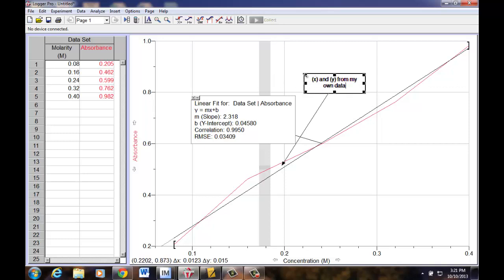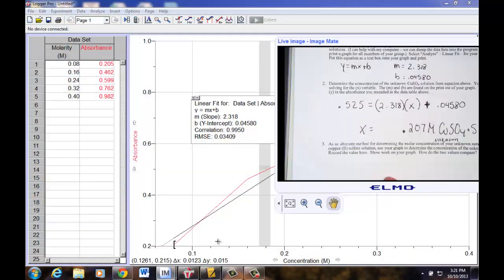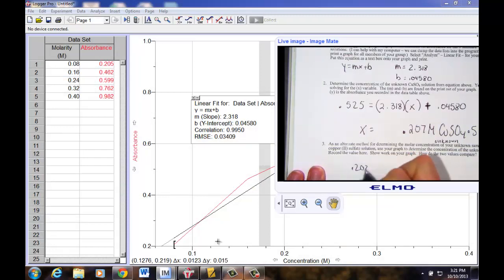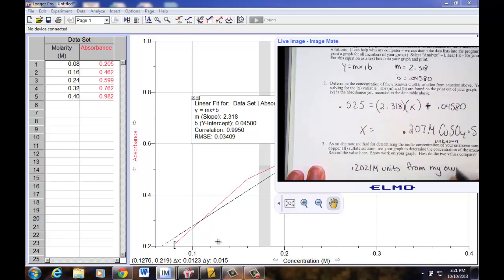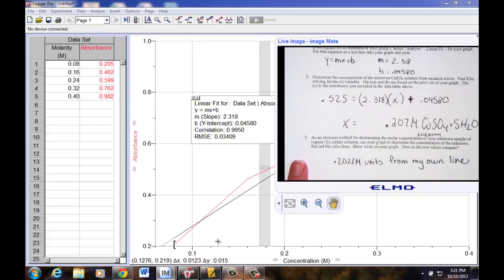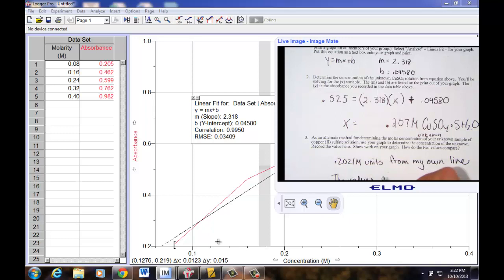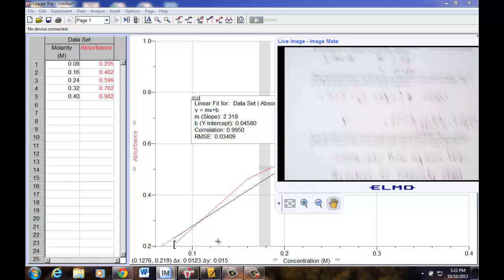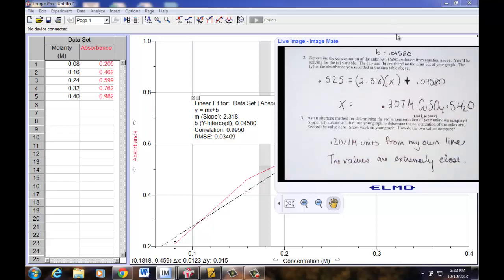This is my X and Y coordinate from my own graph. So now this is the second set of data that you can print, and then that takes care of showing that. 0.2021. So now let's kind of process what that asked. 0.2021 was what I found. See that from my own line, I put a text box in that showed 0.2021 molar units. Using the best straight line, we had 0.207. Using my own line, 0.202. The values are extremely close. And hopefully yours are too. What it will allow you to do is just another opportunity for feedback. How close did your line actually fall to a straight line?